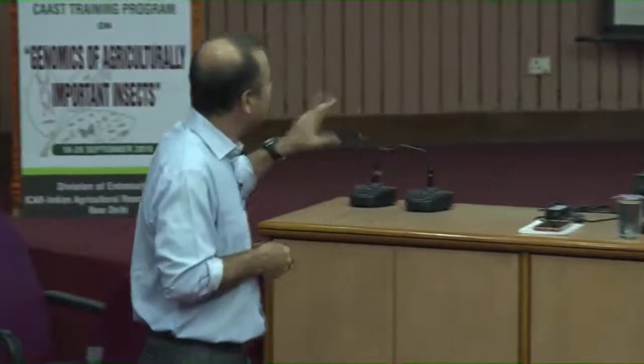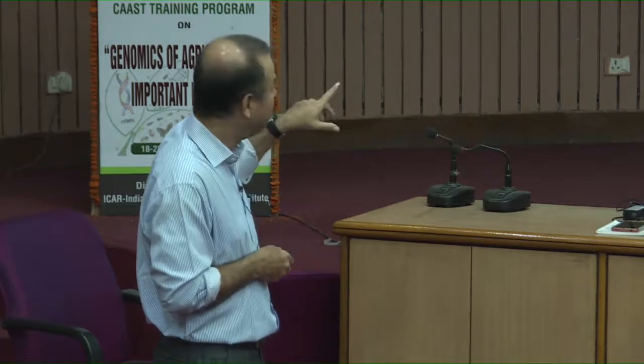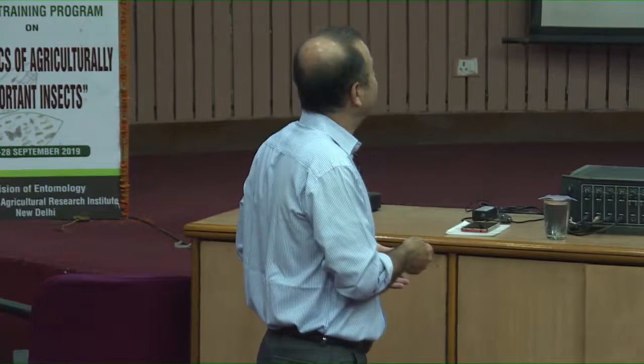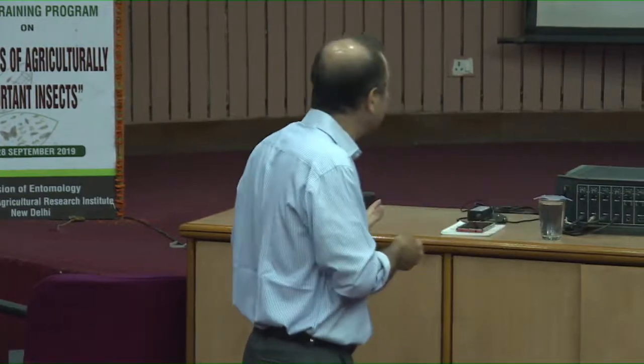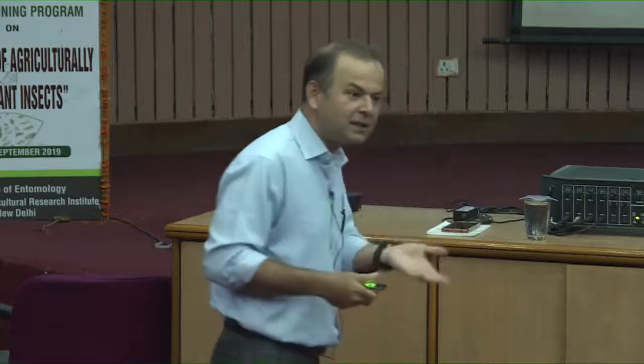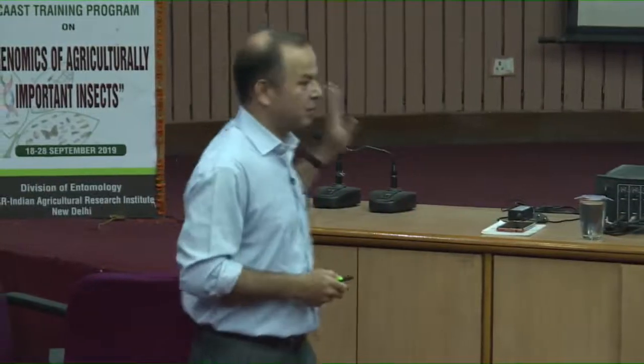So, in the lower graph you can see the copies are also increasing, but they fall flat. Why, do you know? Because it is lesser than this big number, so they look very close, but actually they are also increasing in the linear phase, but they fall flat to your eyes, or whatever detection machine you are using, it cannot make the difference. So, they fall flat, and then after 25 cycles the increase is detected. It is not that the increase is not there, the increase is happening with the same kinetics, but since my machine or my eyes cannot detect, I will think, oh, I do not see any difference between these two bands. So, you have to wait till 25 cycles and then you see the difference, you say yes, now I can see. So detection is important.